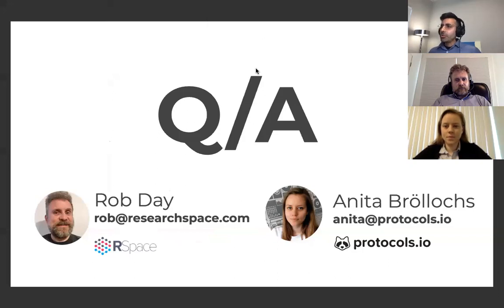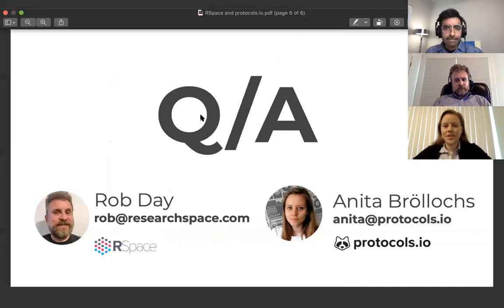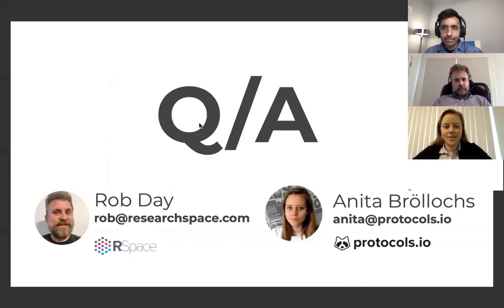The first question that we'll go over is, do you need to have permission from the author to make a fork? Can anyone make a fork of any protocol? I think that's related to protocols.io. Maybe Anita, you want to answer that one? Sure, that's a good question. And yeah, you do not need permission from anybody to create a fork.